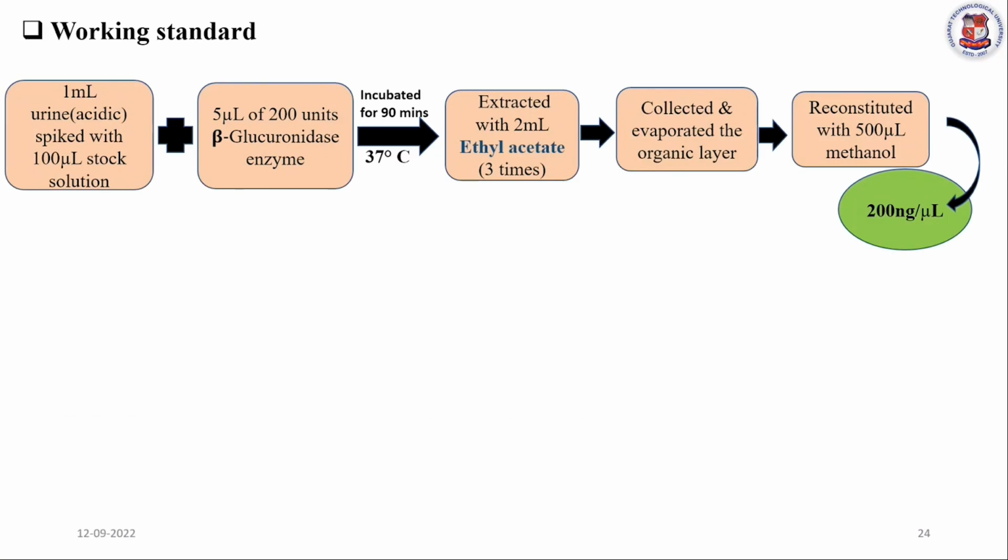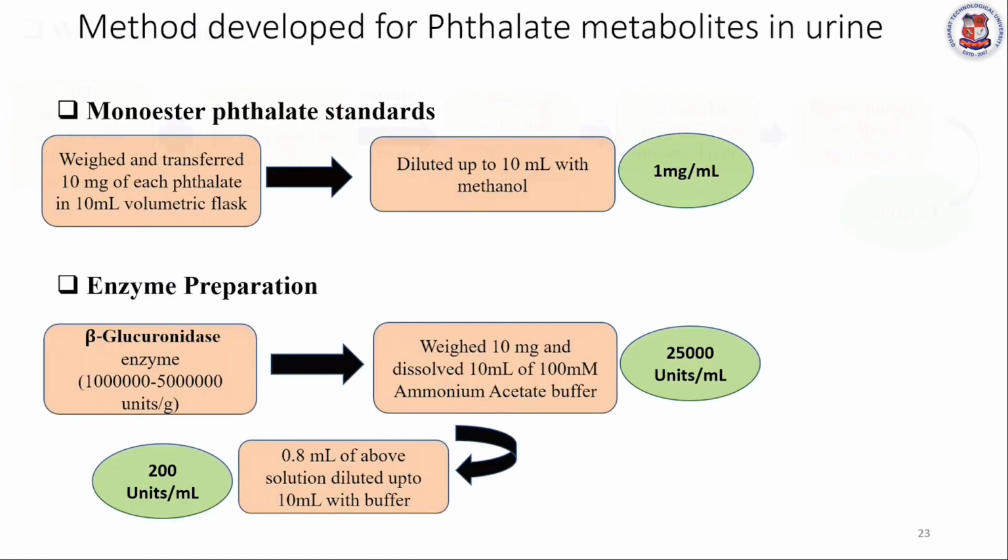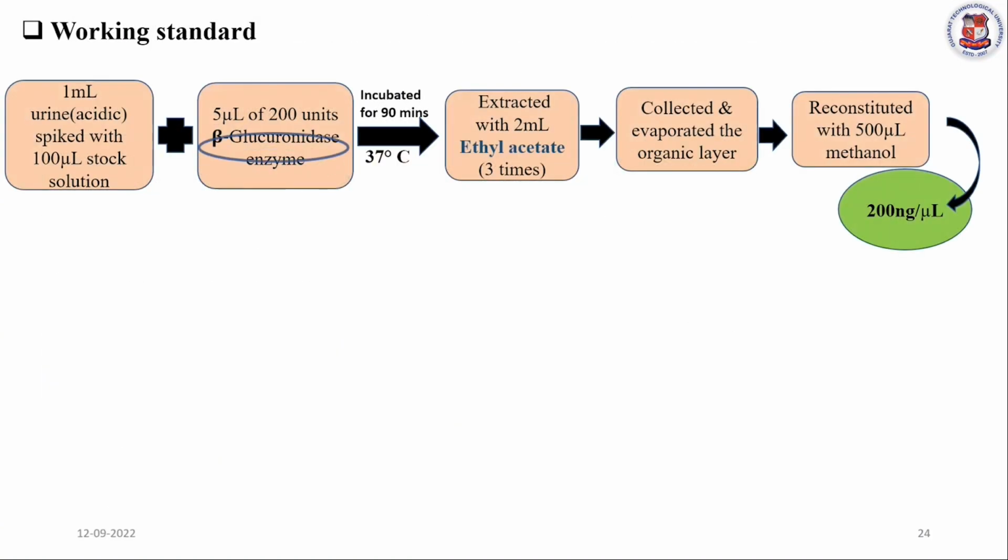These are the sample preparations. We have used the enzyme, and we have used ethyl acetate as the extracting solvent, and we have also checked the effect of the enzyme.